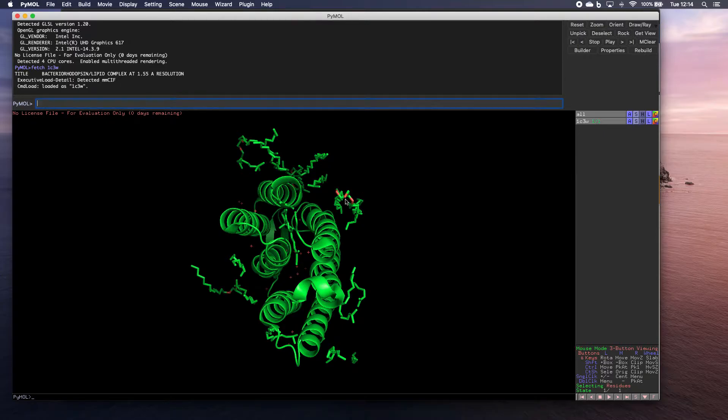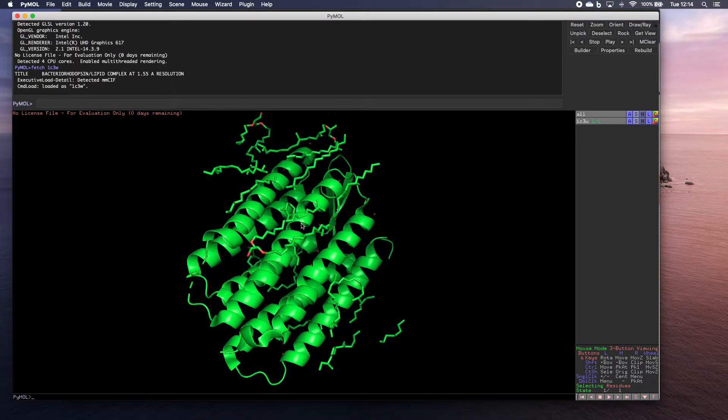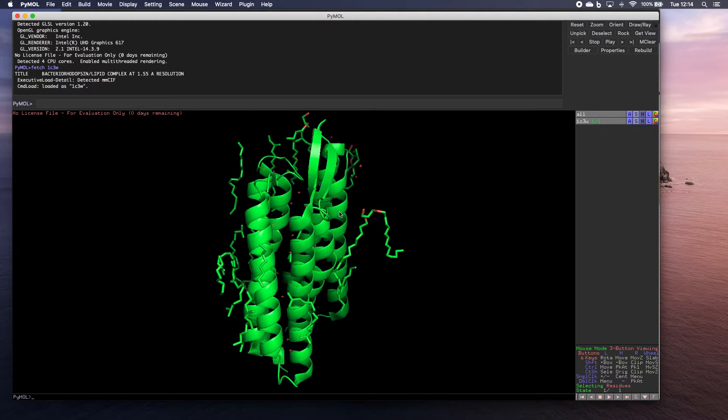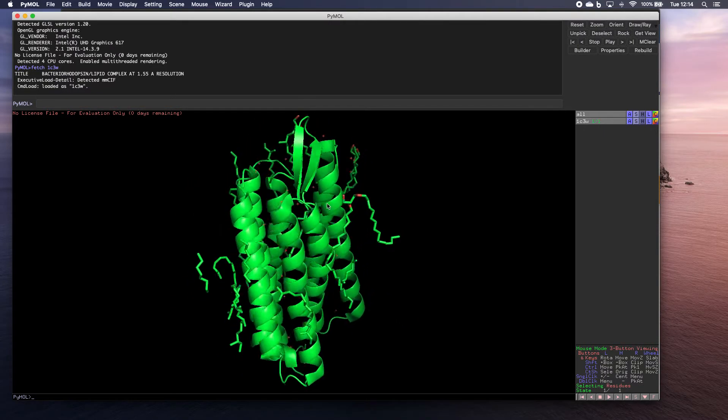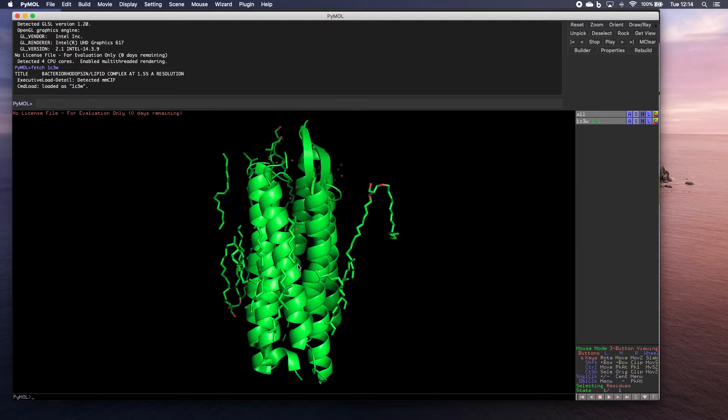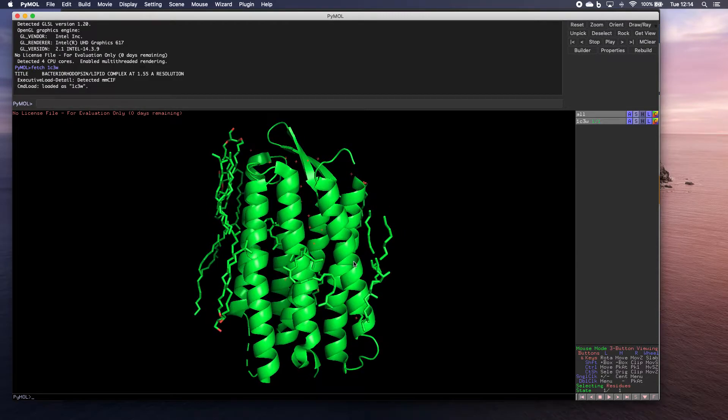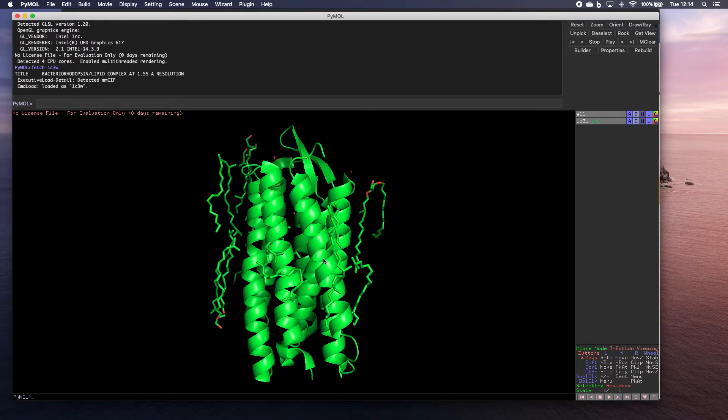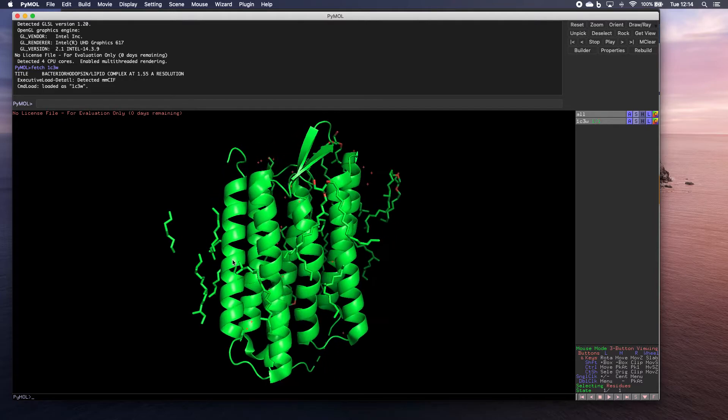There you go. And it has now gone straight to the protein databank and downloaded the structure directly from the protein databank into Pymol.